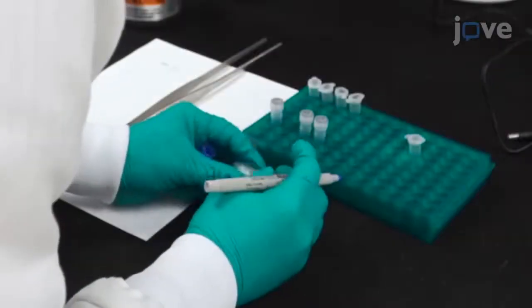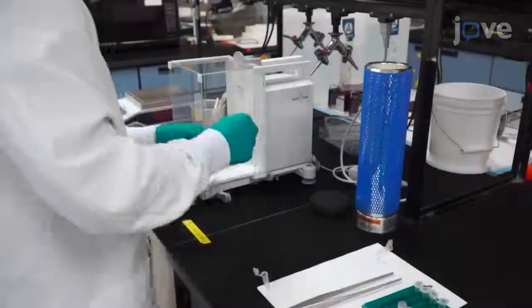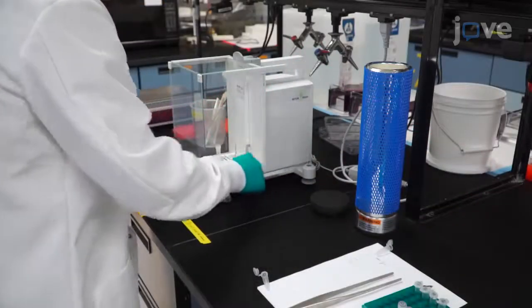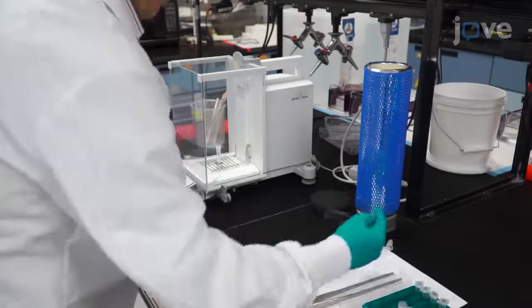Use an ethanol-proof marker to label the side of a 2-milliliter screw-capped bead tube. Next, tare the mass of the labeled bead tube using an analytical balance capable of accurately measuring 0.01 milligrams.